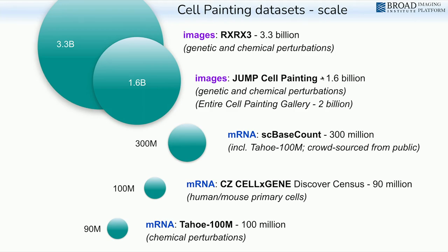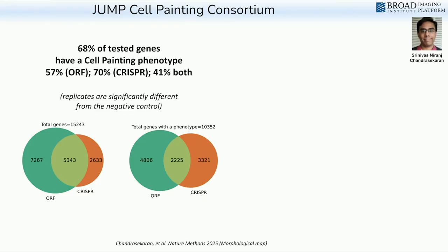So I raise this just because imaging is such a more efficient way to make single cell data, and it is just a beautiful kind of data, which again, I'm happy to share all the comparisons we've done to look at the information content. So I wish people would focus more on images than mRNA, but that's probably not news to anyone in this group.